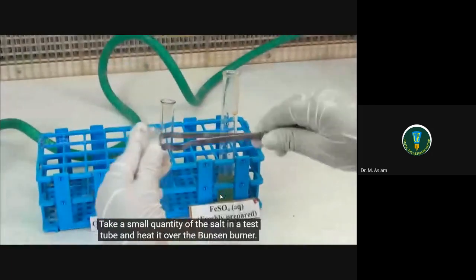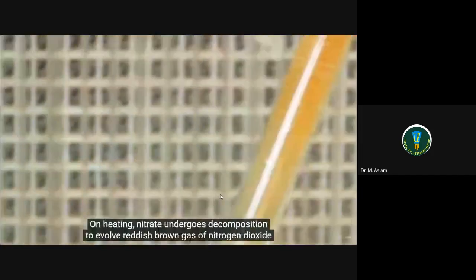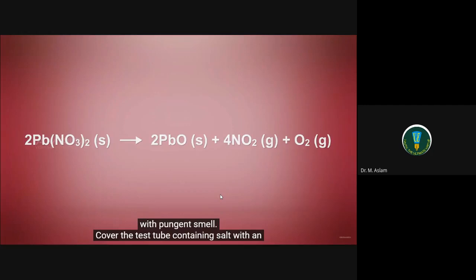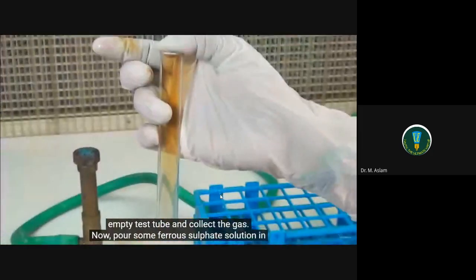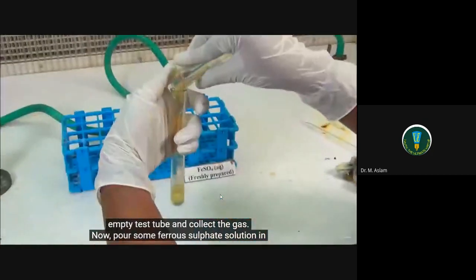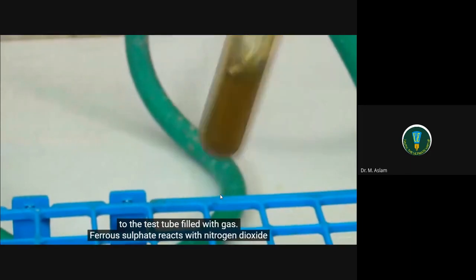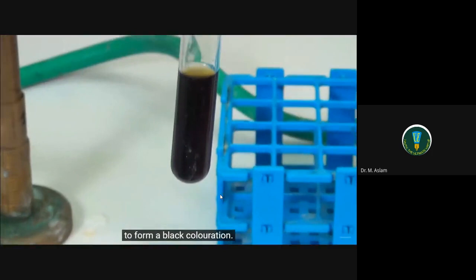Procedure. Take a small quantity of the salt in a test tube and heat it over the Bunsen burner. On heating, nitrate undergoes decomposition to evolve reddish-brown gas of nitrogen dioxide with a pungent smell. Cover the test tube containing salt with an empty test tube and collect the gas. Now, pour some ferrous sulfate solution into the test tube filled with gas. Ferrous sulfate reacts with nitrogen dioxide to form a black coloration.